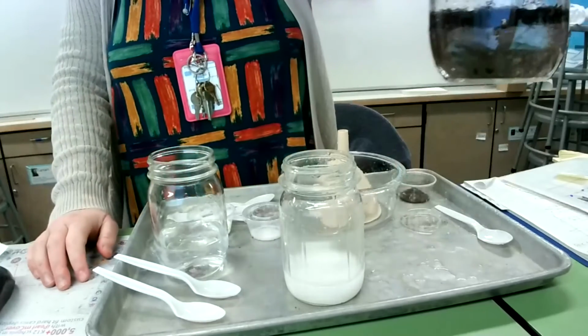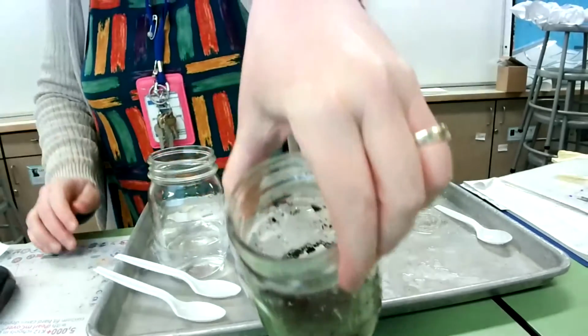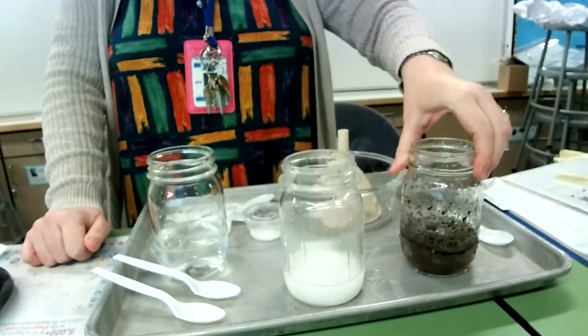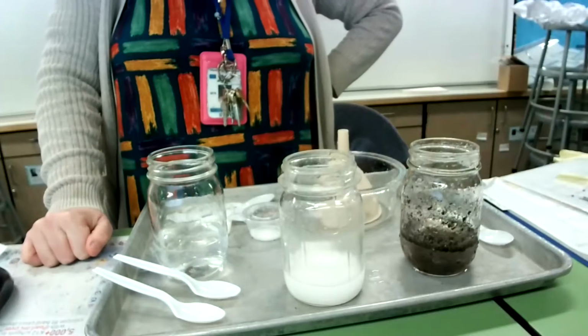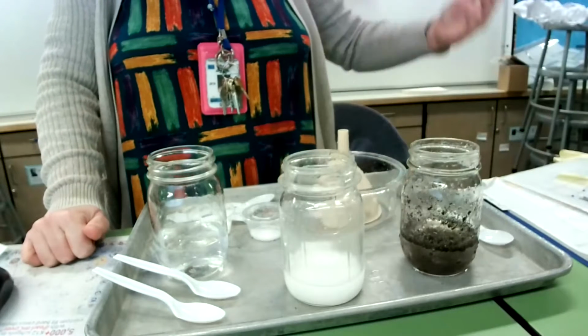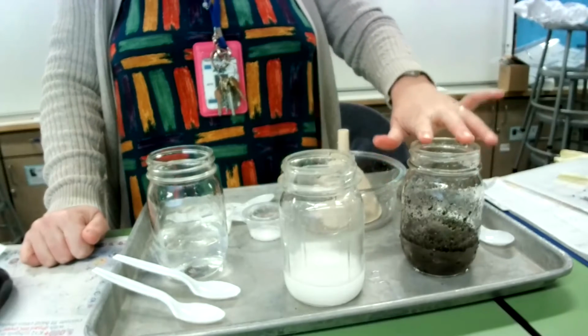Okay, you can see that we've got things settling down to the bottom of the jar and we've got things floating on the top. But the dirt and soil and sand and particulates have not dissolved in the water. They're still there. So is sand soluble? No, because it did not dissolve.